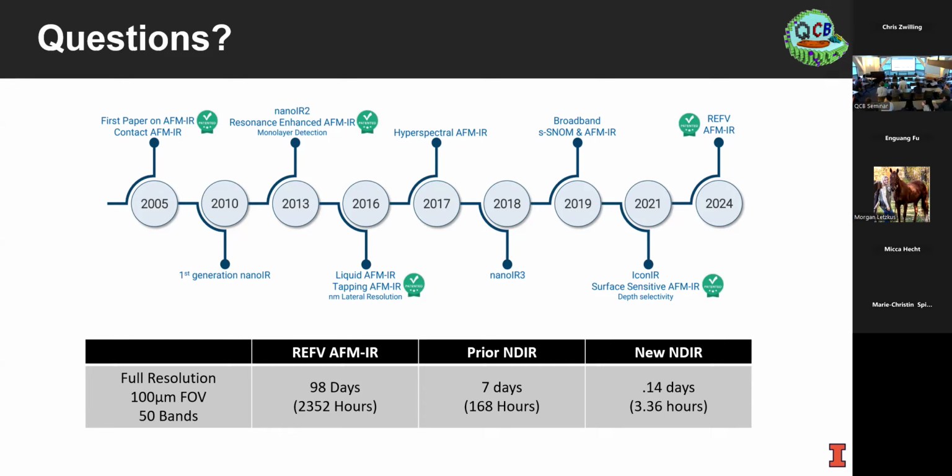Yeah, we don't know the limit. That's a great question, because we don't know the limit, right? So imagine a 20 nanometer hemisphere volume. It has probably tens of metabolites and different concentrations and so on. Now we want to deconvolve all those.